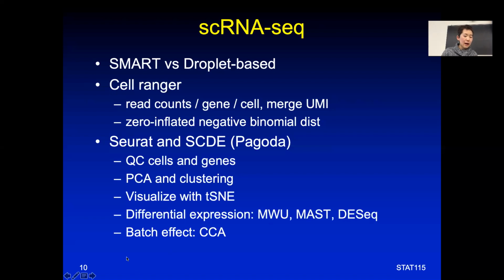And then Seurat also used CCA, this canonical correlation analysis, for batch effect removal. I think that's all the tools we developed, I mean, we discussed in this course.